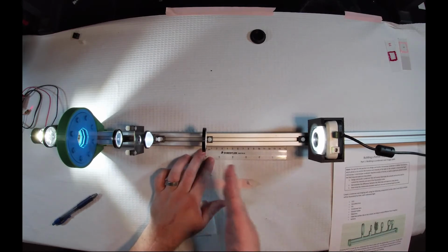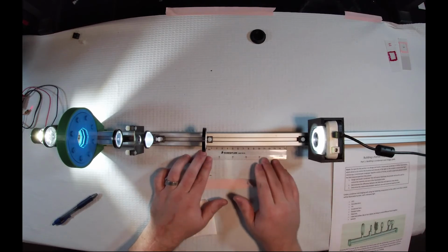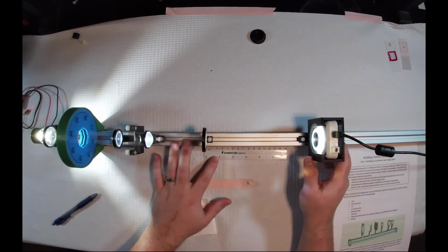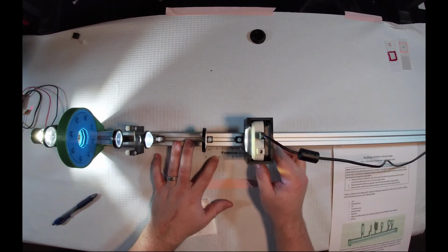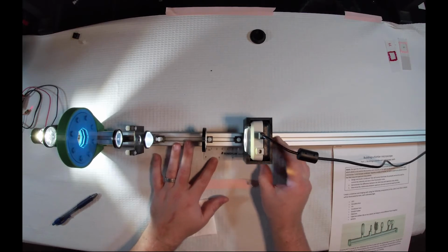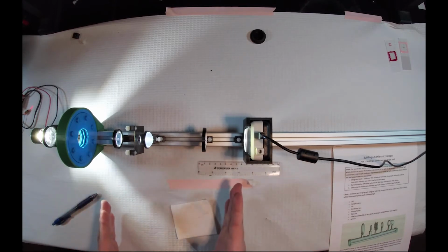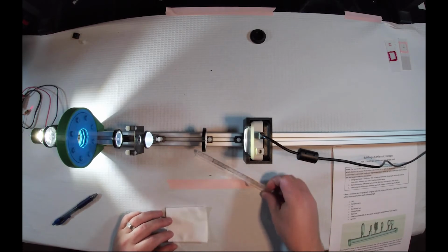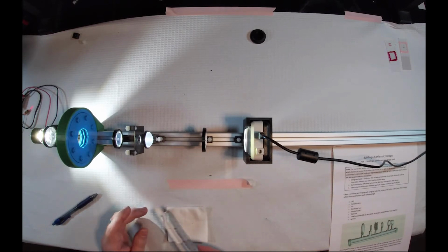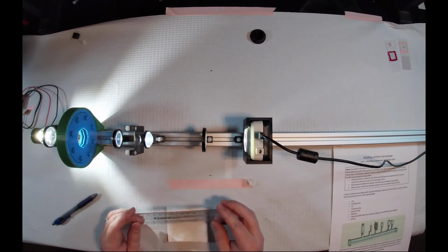Now, we know that our image plane should be one focal length away from our tube lens. And that's, again, another 70 millimeters. So we're going to slide our camera down in there. So we should be close to somewhat of an infinity corrected Köhler microscope setup, but obviously we're not seeing anything on our image plane because we don't have a sample mounted. So the best thing that we can do is go ahead and mount a sample.